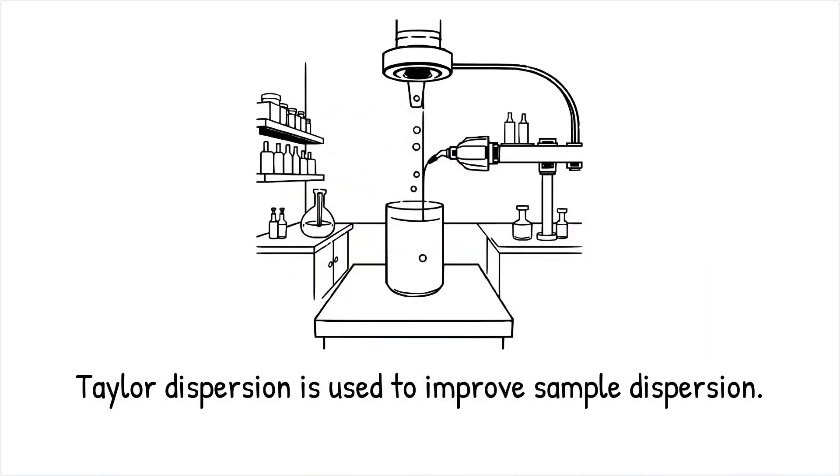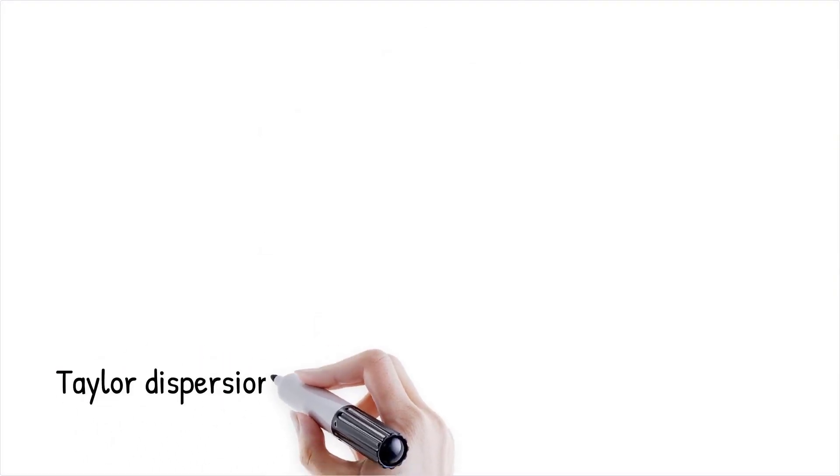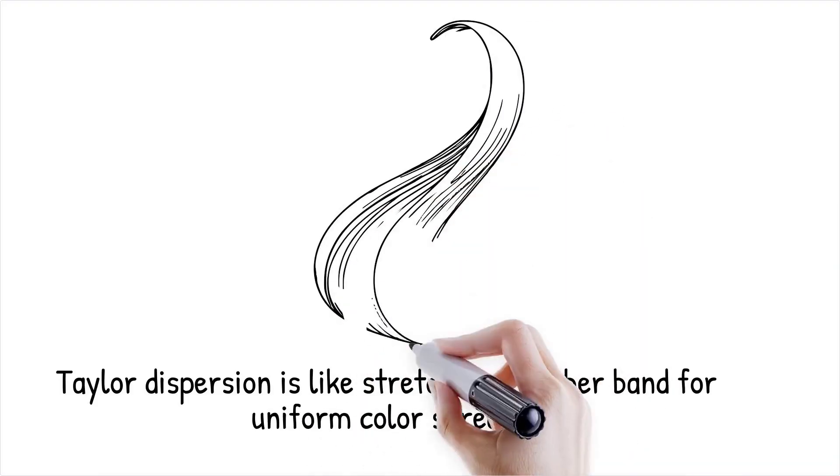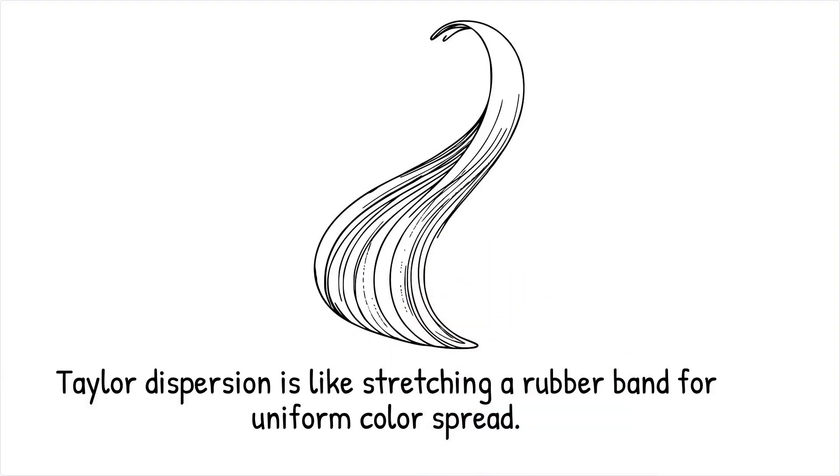Taylor dispersion enhances sample mixing in microfluidic drug screening platforms, ensuring consistent exposure across reaction zones. This effect is like stretching a rubber band - the more it elongates, the faster its color spreads uniformly.